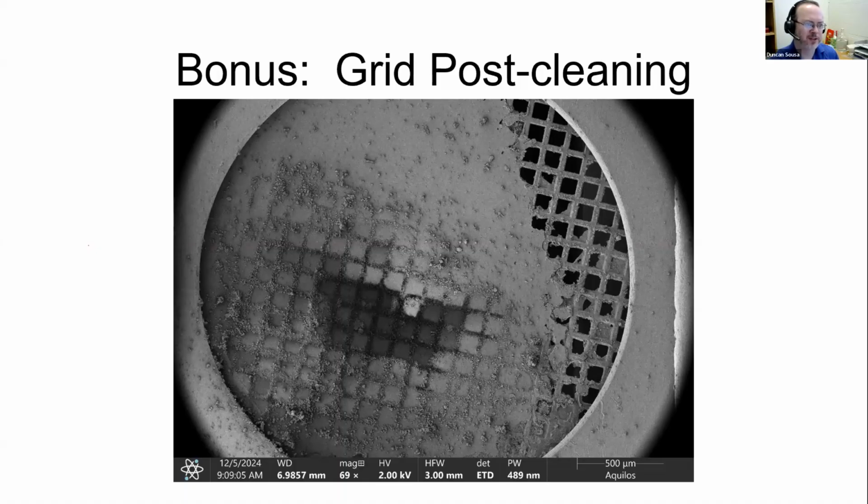We've been trying to think about various different things you could do. You can't really coat it afterwards because that just interferes with your electron beam. I haven't thought of a good way to discharge all those ions, but maybe with an atmospheric, and I don't know if we have a Thermo person here, some way to flow a nitrogen, oxygen gas over the lamella over time, you could let some of those radicals and stuff on the surface react, and maybe they won't be as charged and attractive anymore. These are all just thoughts I had.